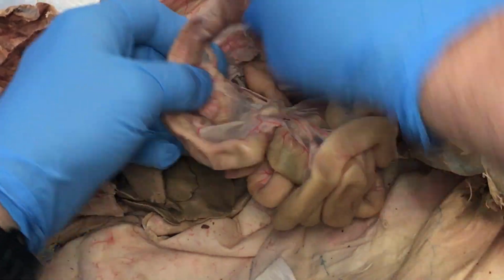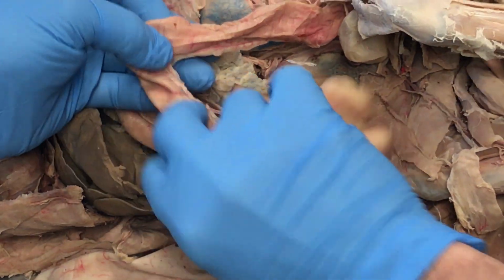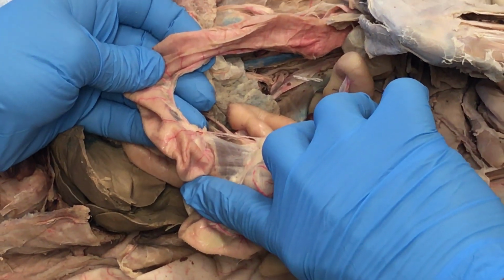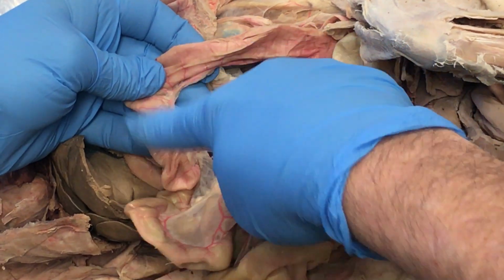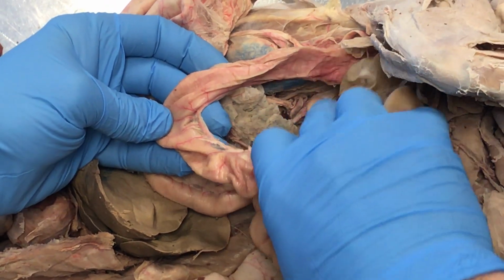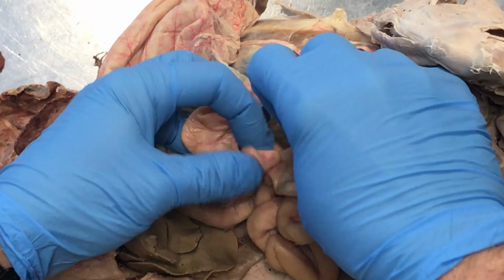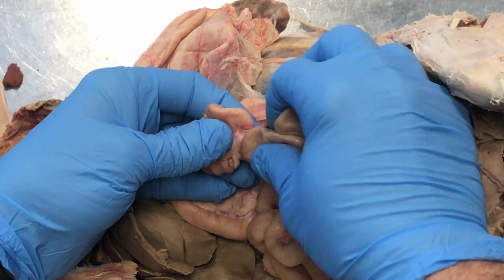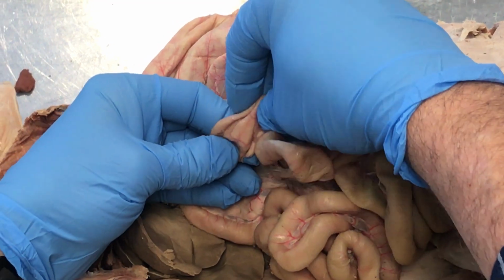Now the large intestine, they've cut it here. There's a mesentery along the back side, but they've cut it. The large intestine in a cat is kind of question mark shaped. Do you see that knee, Genevieve? This is large intestine right there. If I turn it back down, you can see how it's kind of question mark shaped. Okay, it comes up like this. So this first part right here, this little part right here is the cecum. That's where the small intestine dumps in. So this little appendage right there is the cecum.